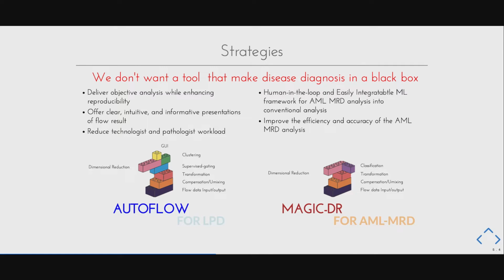One thing I would like to emphasize is that our approach of machine learning or machine-assisted analysis pipeline is to help or assist the diagnosis instead of making the decision for you.